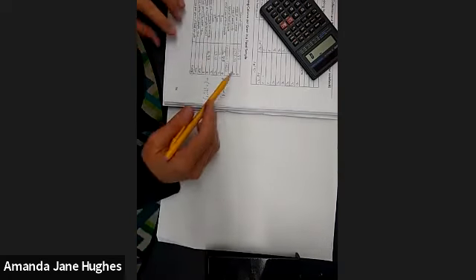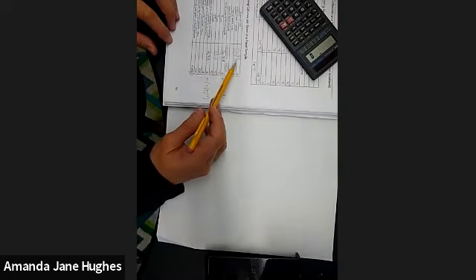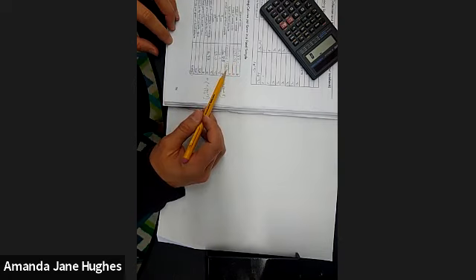All right. With this video, we're going to walk through how to perform the calculations to determine the number of calories per gram of food sample. So I have here the data I collected from the lab, which included the mass of the aluminum can, the mass of the can with the water I added. I analyzed a crunchy Cheeto.